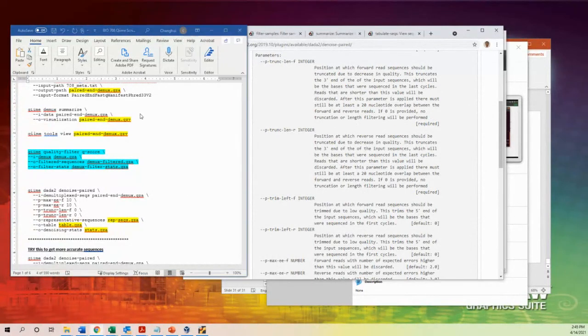But when we look at the paired-end demux, you can see the forward maybe at 145 is a better sequence, so you can truncate at 145. For the reverse, you can look at the quality view, see the bad quality at which location, then put that location here. So you can do 120. That means the sequence after 120 will be chopped off, they don't keep it. That's what truncation means.